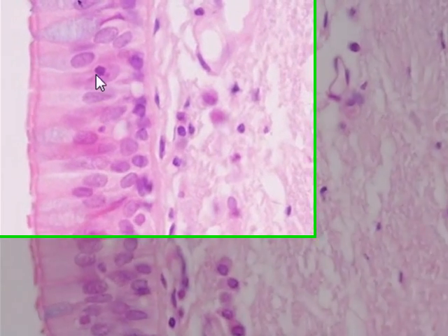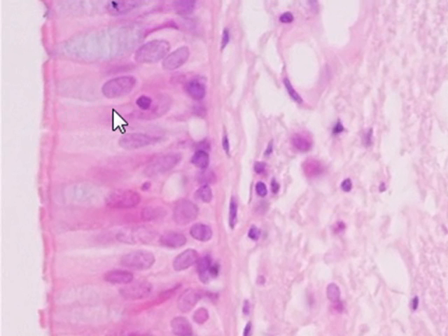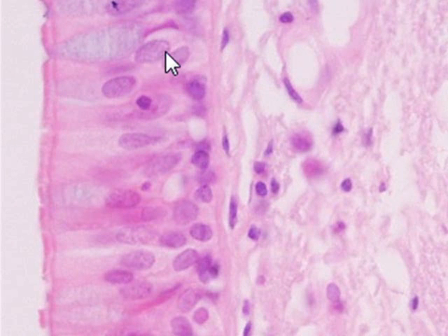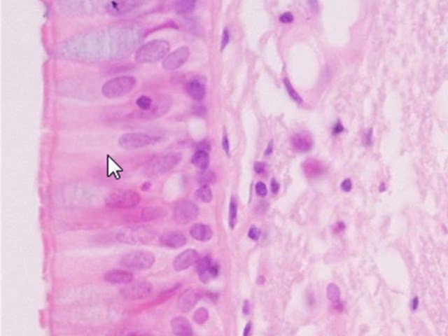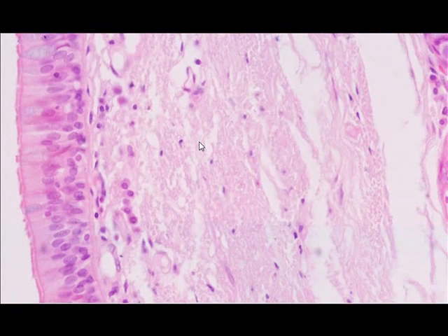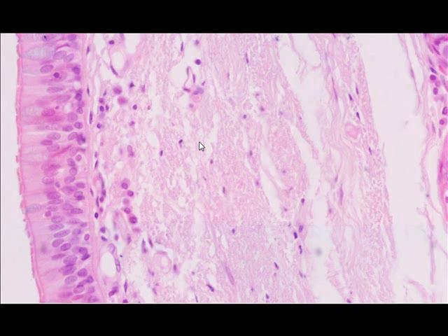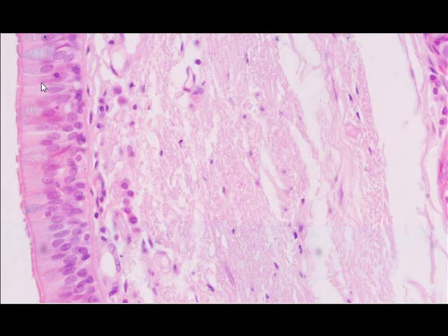Some of the things we wanted to identify were nuclei, cytoplasm, plasma membrane, and related structures. The nuclei appear bluish in color, the cytoplasm is pinkish, and you can see plasma membranes separating cells. As you know, every human cell is covered by a phospholipid bilayer known as the plasma membrane, which also has proteins and other components. It often appears as a thin boundary between cells.